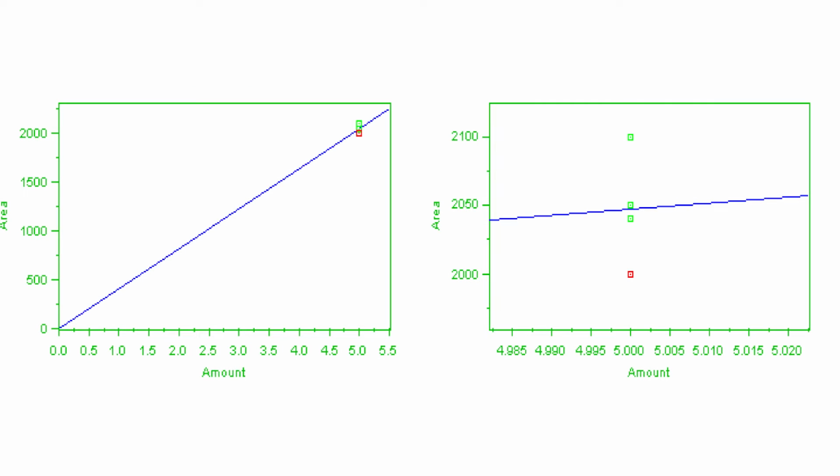Of course, if the same dilution of the standard stock solution were repeatedly injected, each raw file would yield a slightly different estimate of the response. By giving each of these injections its own data point, the calibration curve may be made to reflect the average detector response, which may be assumed to be a better estimate than given by a single injection.